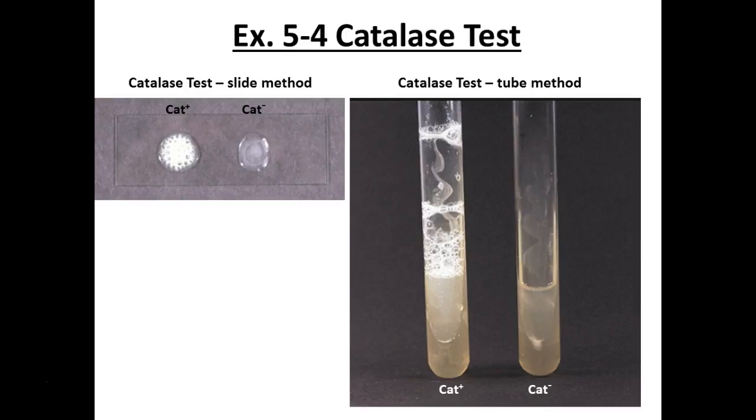So you're going to put your organism on the slide, and we're going to add some hydrogen peroxide to it. You should hopefully see bubbles, right? Because as I said, all your organisms have an electron transport chain that can use oxygen as the final electron acceptor. So everybody should see bubbling. The one organism that we had that didn't bubble was yet again a pathogen. So I have to find us a new non-bubbler.